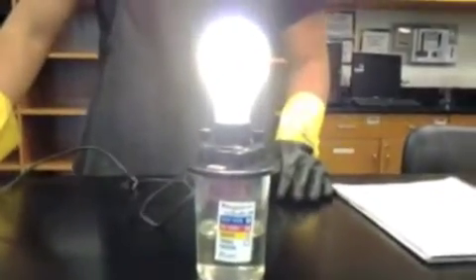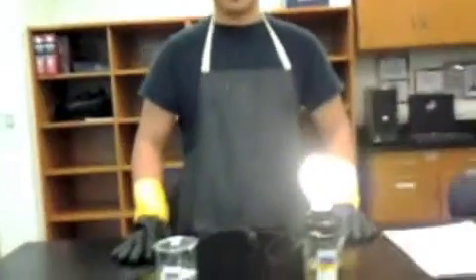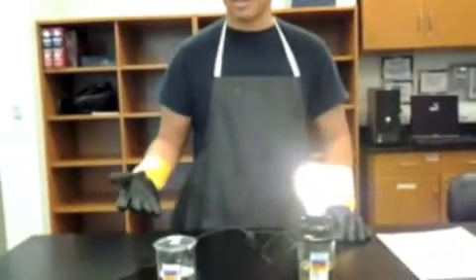As you see here, the light bulb lit up. Therefore, the magnesium chloride has electrolytes within the solution. And as you see, if you look closer, there are bubbles forming around the electrode. So that is one way to see that the electrons are flowing from the electricity outlet and into the solution and into the other electrode, creating the electricity.